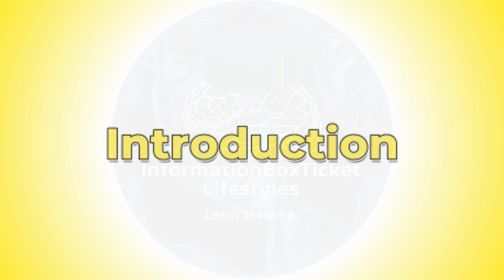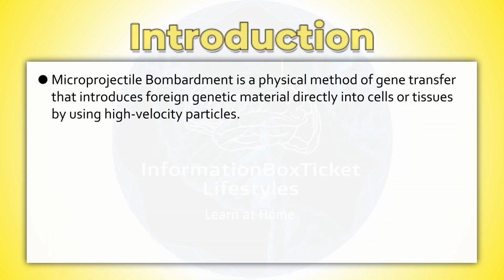Introduction to microprojectile bombardment. Microprojectile bombardment is a physical method of gene transfer that introduces foreign genetic material directly into cells or tissues by using high-velocity particles.